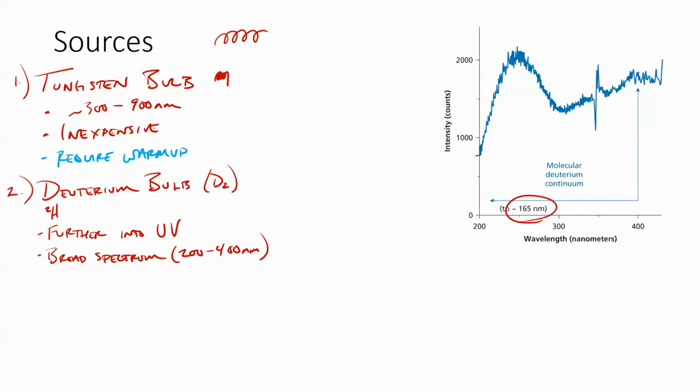So if we have a light bulb that needs to get UV light out of it, we've got to make at least some part of that enclosure out of quartz. We could make the whole thing out of quartz, which would be crazy expensive. But what generally happens is that if this is our light bulb base, here's our glass envelope, they call it. It looks kind of like a minion.